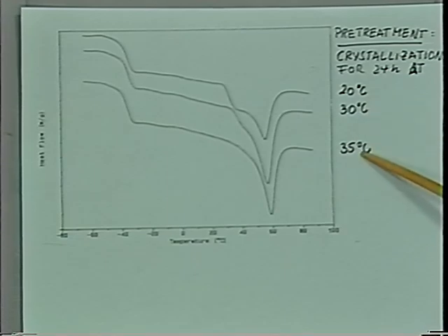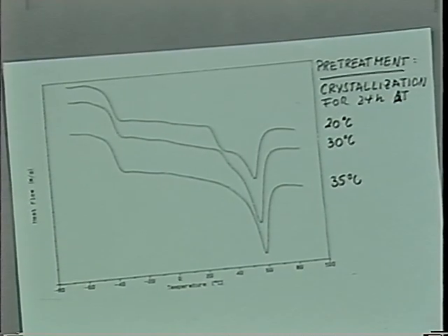It seems to be a high sensitivity to the degree of supercooling. Then there's a nucleation and growth process which probably follows different evolutions. And in the DSC you couldn't conclude that very easily. But combining this with the rheology, you know there's something interesting happening, and in Bob Lenz's group, they're now looking at details of the crystallization process, and then when we combine rheology with the morphology, we learn about something interesting.